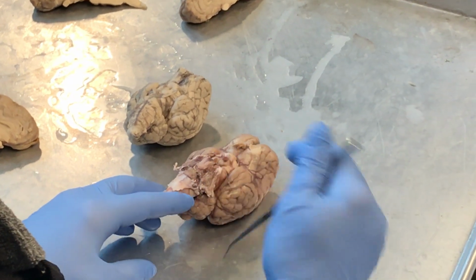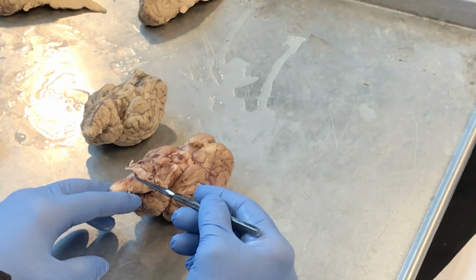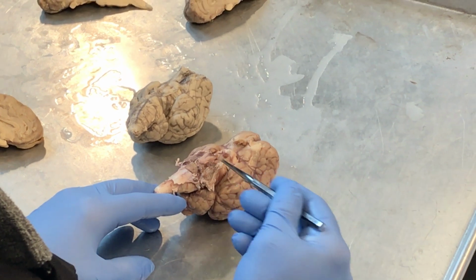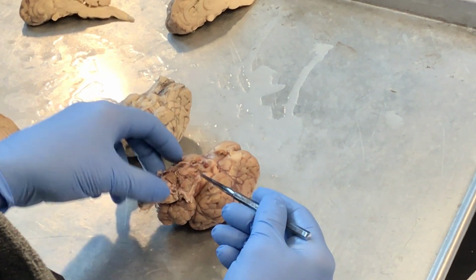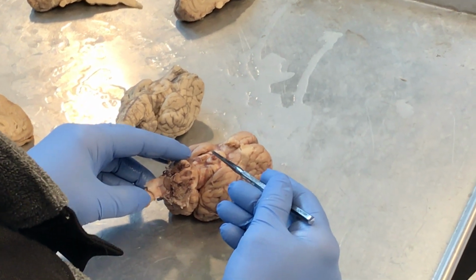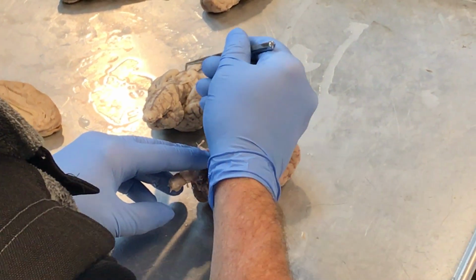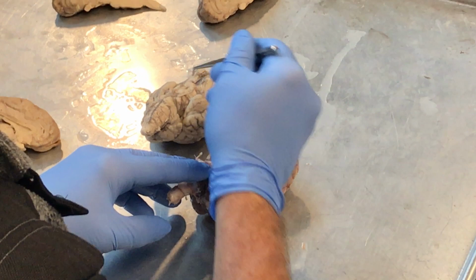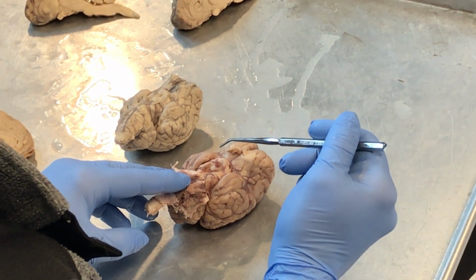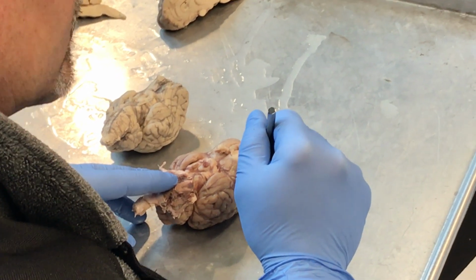But here's the problem. It sits in the dura mater. Remember, this is the dura, the tough mother, the opaque or non-see-through layer. So this is pituitary gland right here. When we pull the dura mater back, we pop the pituitary gland off of the infundibulum, which sits right here. Infundibulum basically means stalk. It connects the pituitary gland to the base of the brain. This infundibulum has been removed on this one, so you no longer see it. You can still see a little bit here. You can't see it there. So that's infundibulum, mammillary body, hypothalamus.